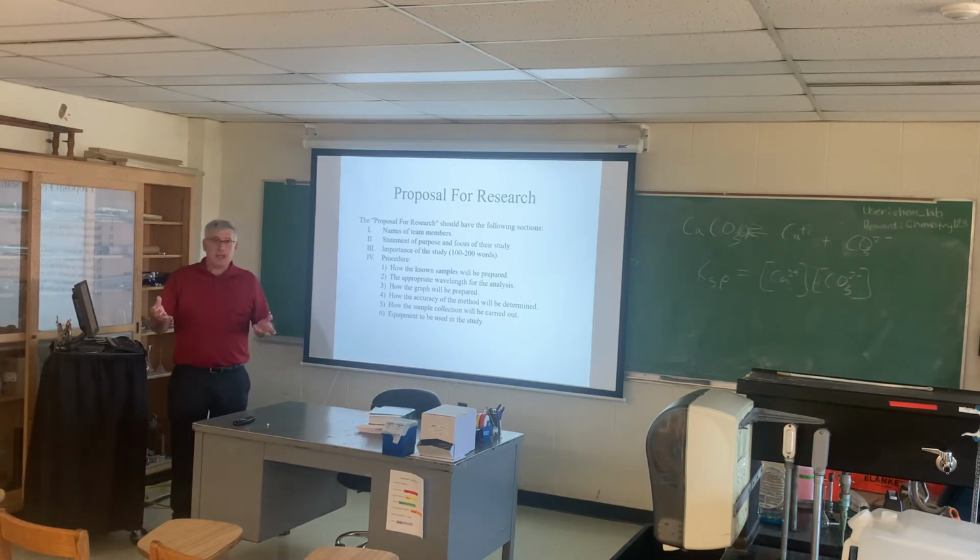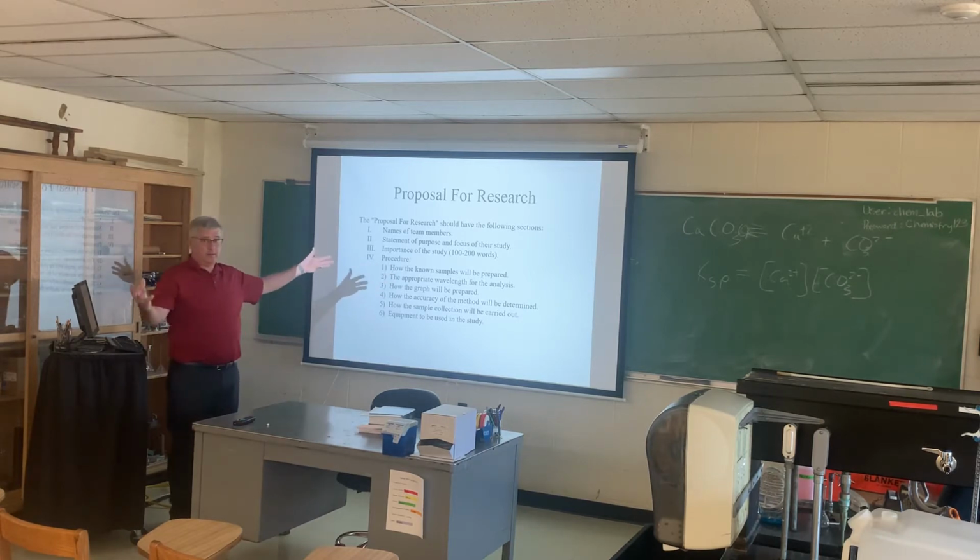So I'm going to focus this conversation that we're having in this lecture more on the bigger project. I've got a couple slides at the very end of the procedure, but I want you guys to develop your own, and I'm going to guide you as much as you need, and I've given you enough information to analyze for phosphate in this week's laboratory setting. But let's talk a little bit about the bigger project.